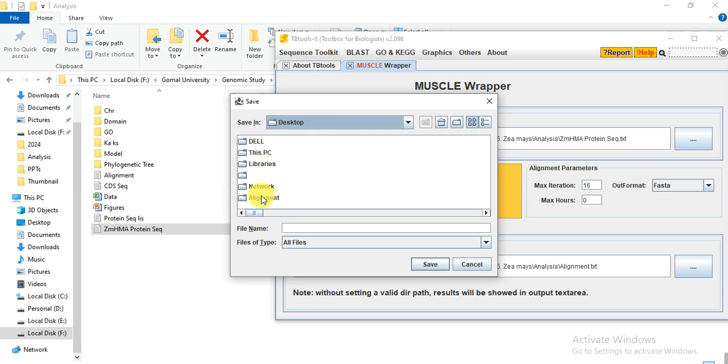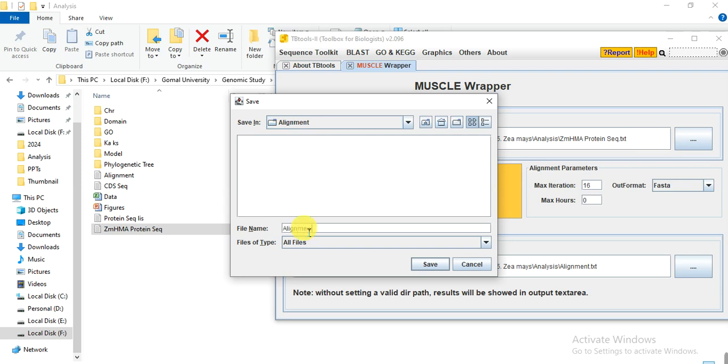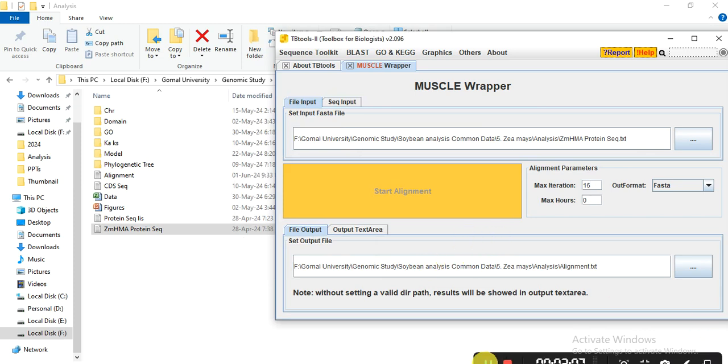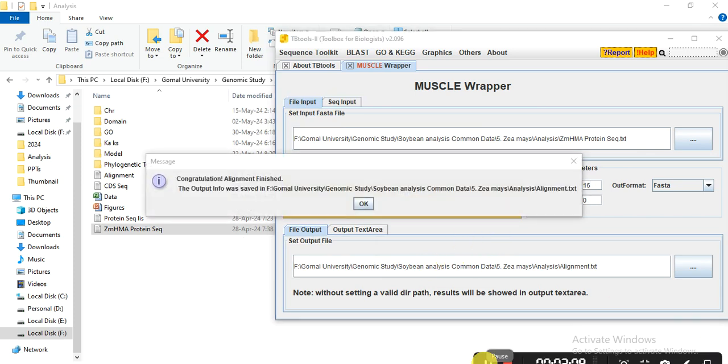So I want to save in that folder and write the alignment name of that file and save. It will take some time. Now the message appears that congratulations, alignment finished.